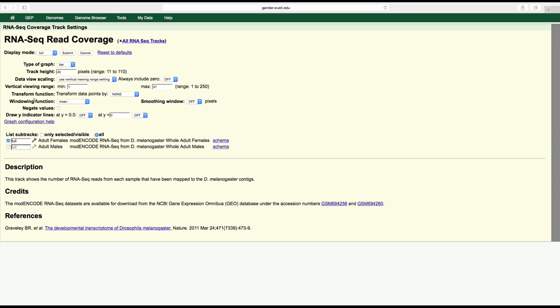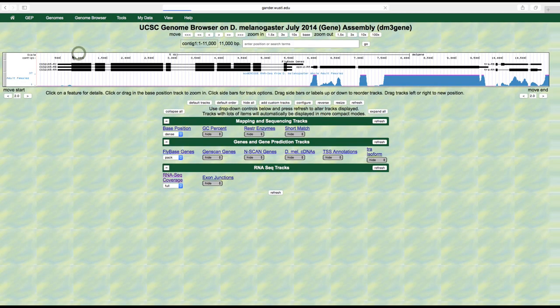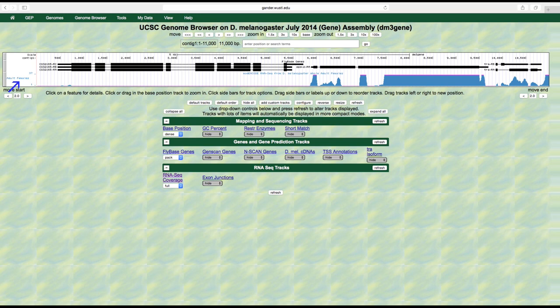Unselect the adult males track under the list subtracks section and then click submit. By unselecting the adult males option, the genome browser will only show the RNA-Seq read coverage from the adult female sample. If we did not unselect the adult males option, the default would be to display both the female and male data as two separate subtracks on the genome browser.